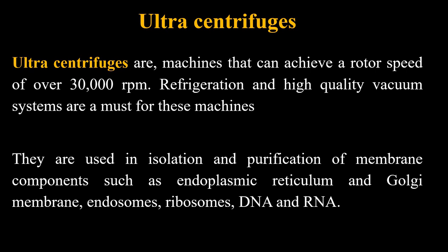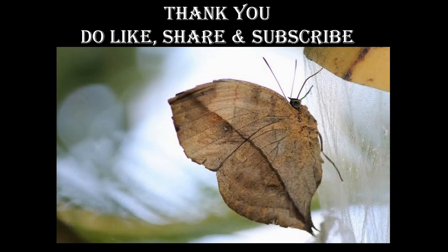All these centrifuges are of four types, and only two are included in your syllabus. So we have finished the centrifuges with respect to the introduction, principle, and last one, application of the centrifuge.